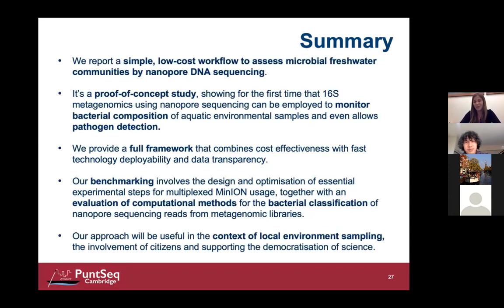And as we have learned during the last Accessible Genomics talk, there are definitely approaches on the way that try to make everything, not only the sequencing approach, feasible in remote locations. This was actually our plan at the beginning as well, to really develop every step remotely, but then we just didn't have enough money to buy all these portable devices. But it really seems as if this is becoming possible at the moment.